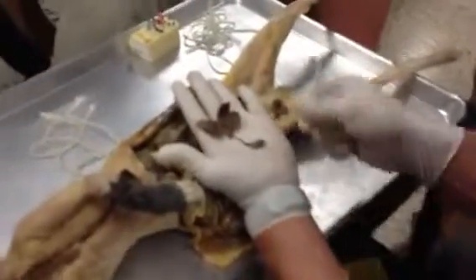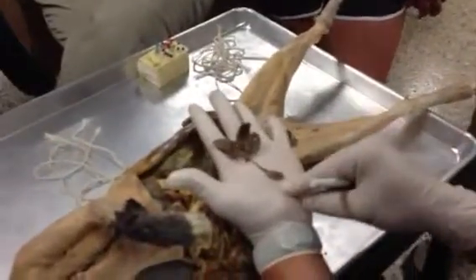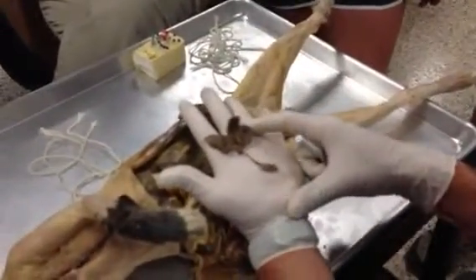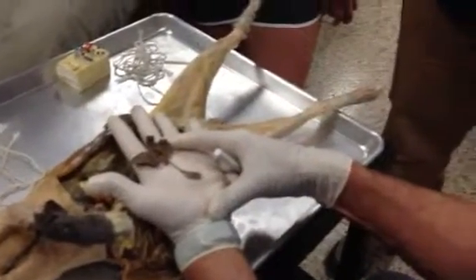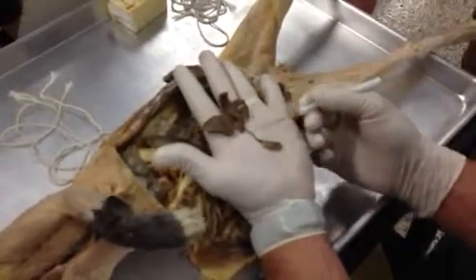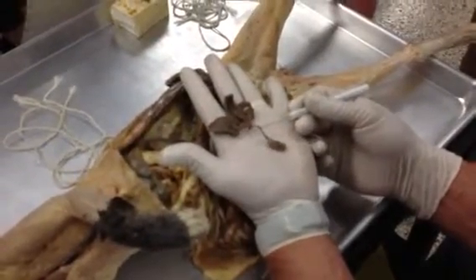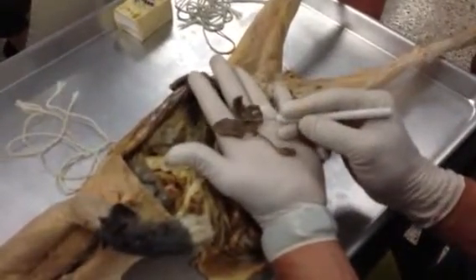Right? I mean, that's the size, the length of my fingernail. Alright? That kitten is going to be the length of my palm, very, very comfortably. Even longer, bigger. And it's going to look like this before it is born. Alright? There is the umbilical cord. It attaches the fetus at the umbilicus to the placenta.